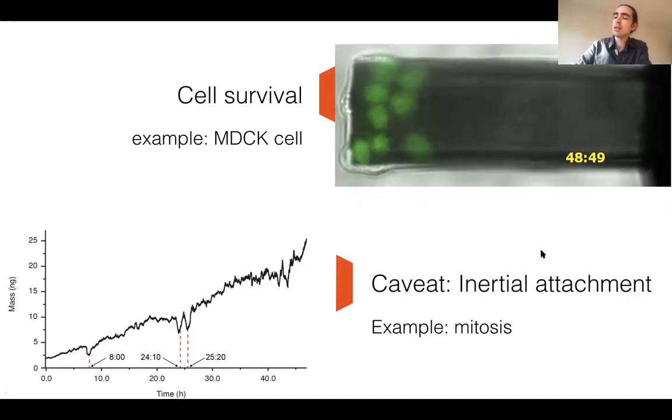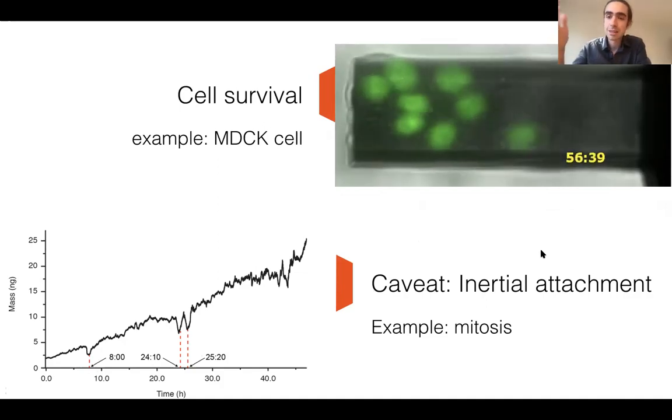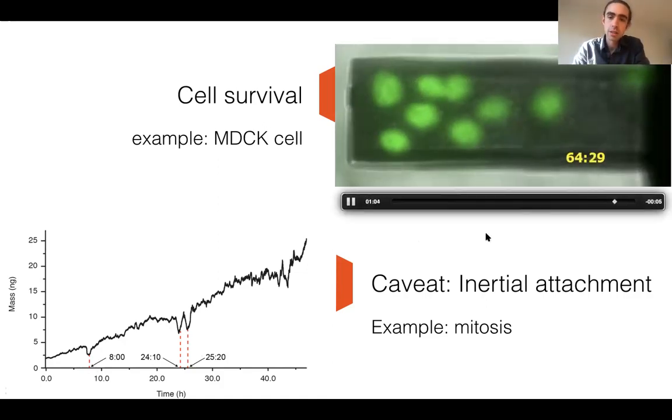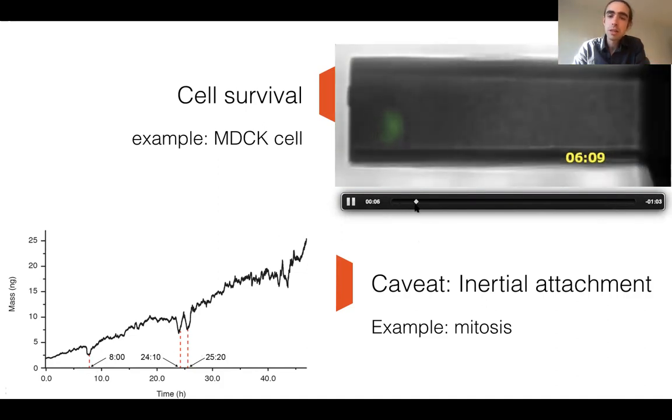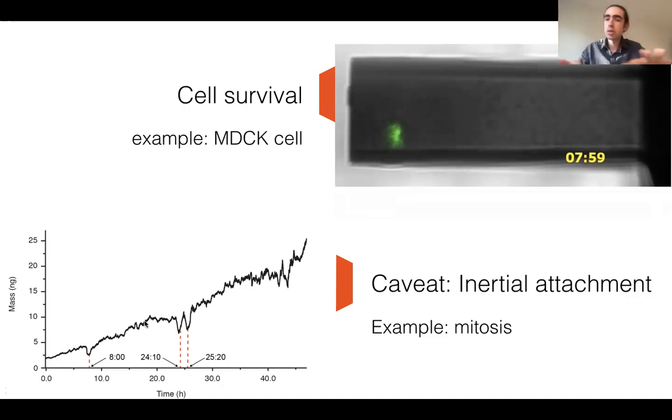What I told you before is that we want to see how the mass of the cell is affecting the resistance against the acceleration of the cantilever, and that actually only works well if you have whatever you're looking at well attached to the cantilever. And now during mitosis, what happens, as you see here, or we'll see in a moment, is that the cell is hardly to be seen because it's very flat. So you have a hard time to see the borders. But now as it rounds up, you can much more clearly see the cell here. And the rounding up at the same time actually relates to a losing of the attachment in these areas. So it's really balling up. And in that moment, we see a reduced mass. So then we'll get an apparent mass here. This is the dip where the mitosis is happening, because the cell loses the contact to the cantilever.